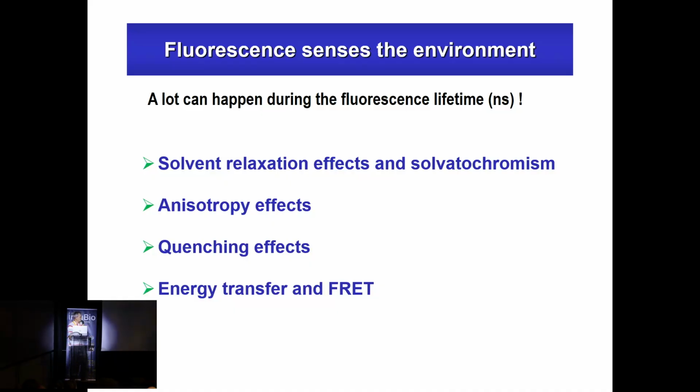Quenching effects also, so the fact that you may have an encounter between a fluorophore and a quenching molecule, and this can reduce fluorescence. And you have all these aspects of energy transfer and FRET, for example.